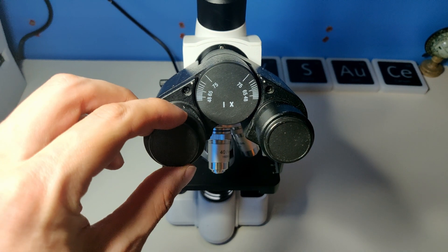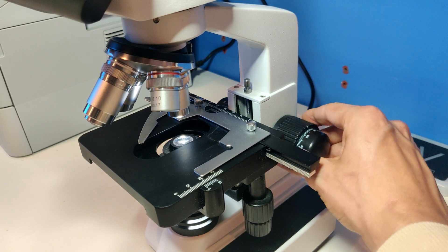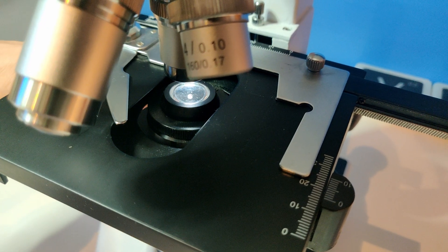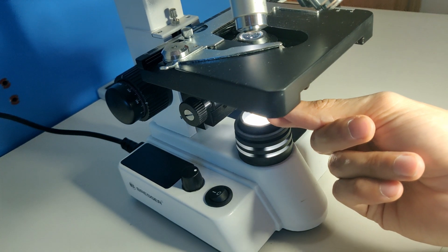First you need to remove the protection caps and turn the microscope light on. In the starting position the stage must be set as high as possible. You do the same for the condenser. Then close the diaphragm completely with the little switch at the side.